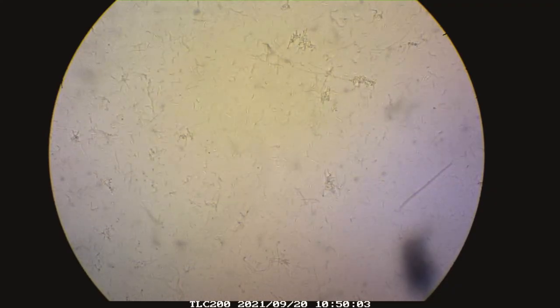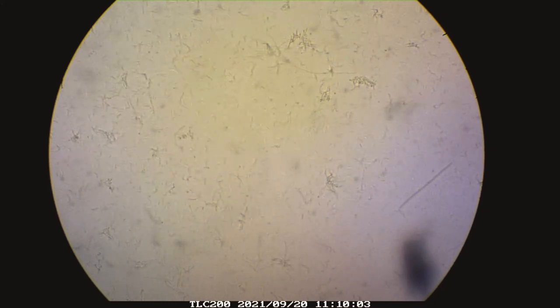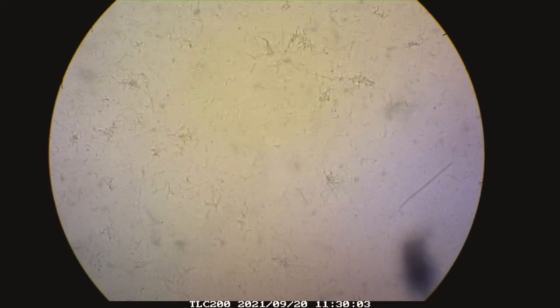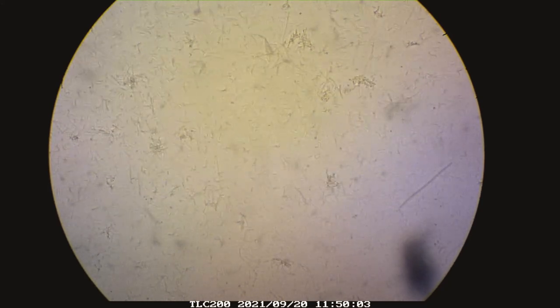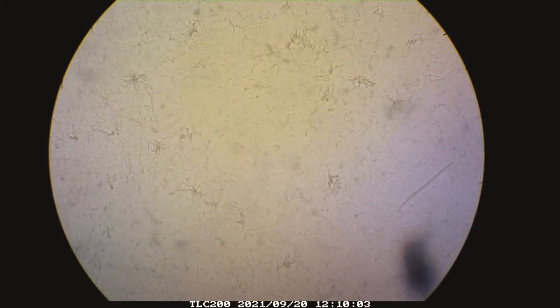I might do a video in the future with higher magnification to get better image quality, depending on the microscope I can get in the future.